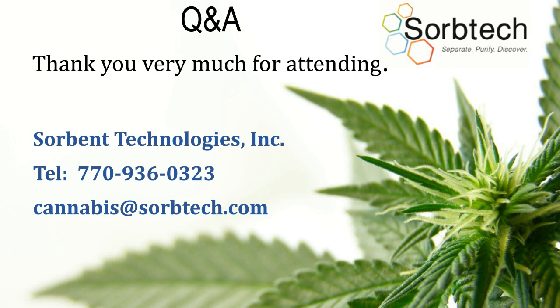What pesticides cannot be removed by silica gel and fluorosil? Well, together they can remove almost everything except piperonyl butoxide. Fluorosil, no, fluorosil gets rid of piperonyl butoxide. Fluorosil does not help you very much with nitrogen heterocycles.